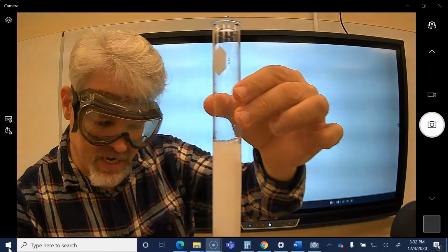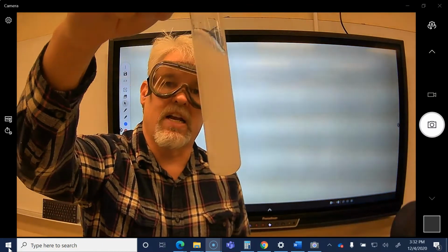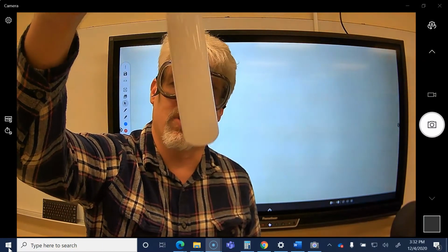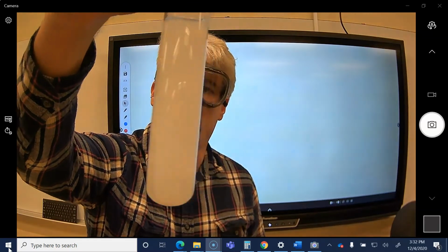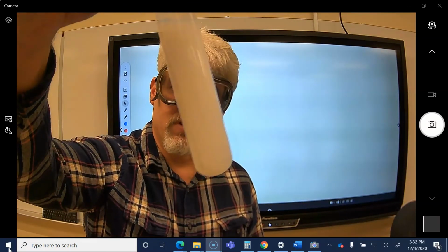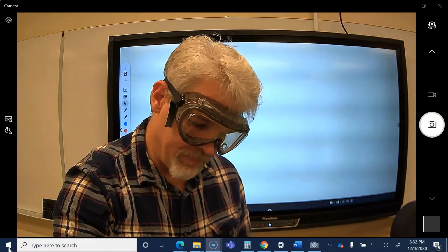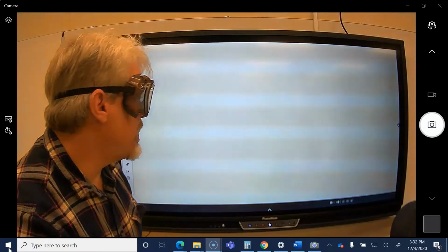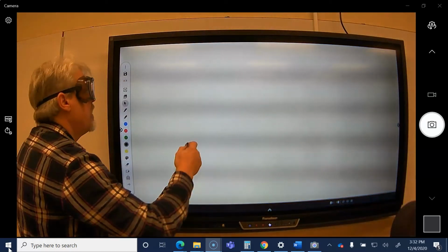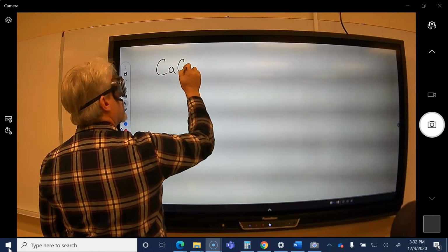Almost instantaneously, you see that the calcium finds the oxalate ions dissolved in that solution, and they're like, whoops, we're not a strong electrolyte, we're a weak electrolyte, we're going to fall out of solution as a solid precipitate.